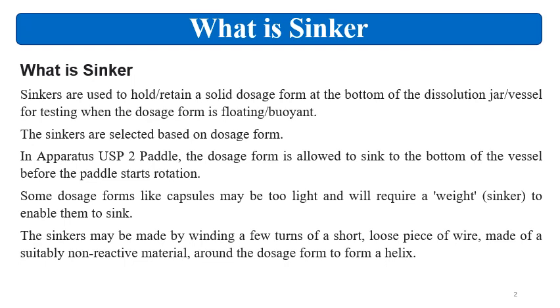And if the dosage form is not sinking at the bottom, or if it floats or sticks to the bowl on the inner surface, so this will lead to the variation in the dissolution rate and the extent.